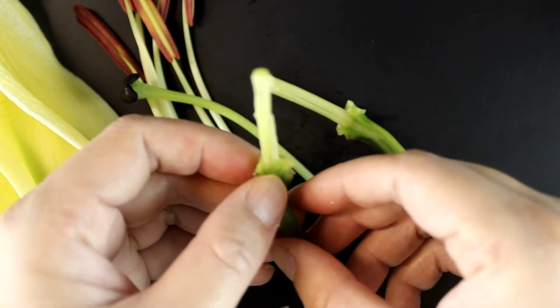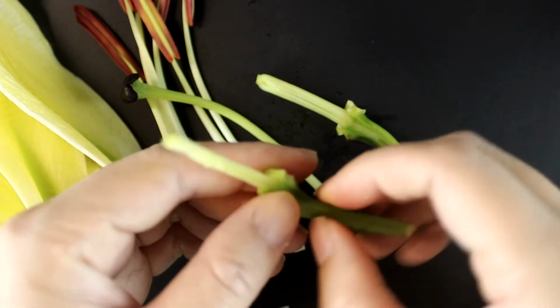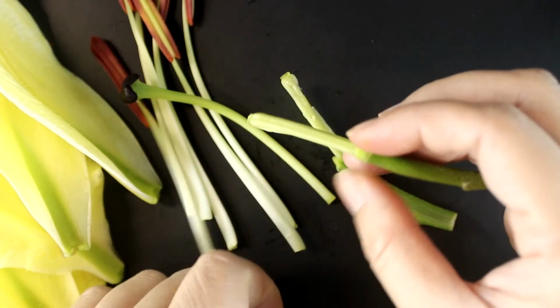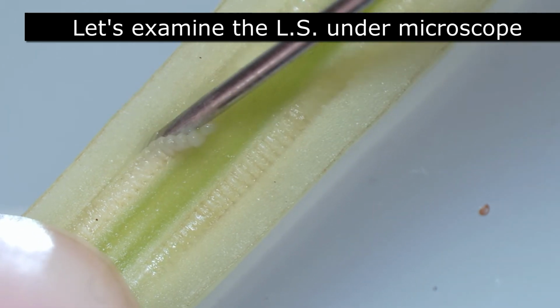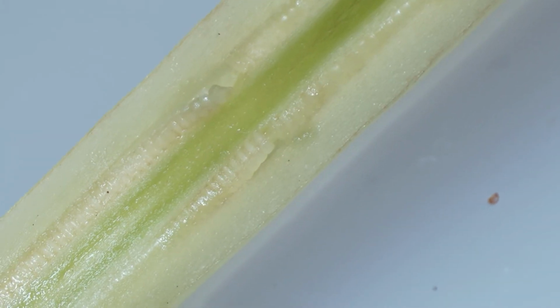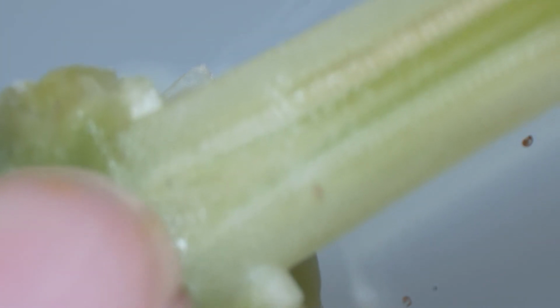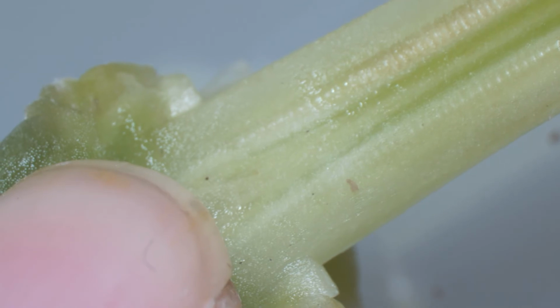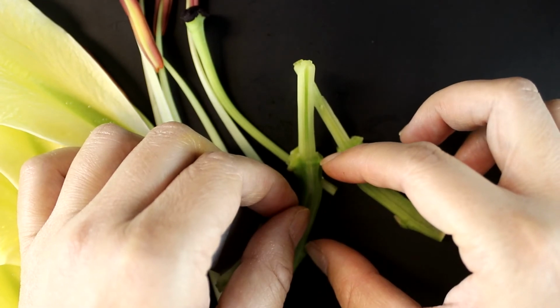Of course, we should look closely under the microscope in order to confirm it. So this is the ovary, and this is just the receptacle.